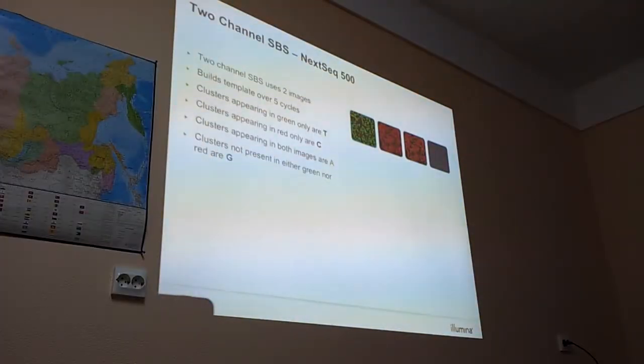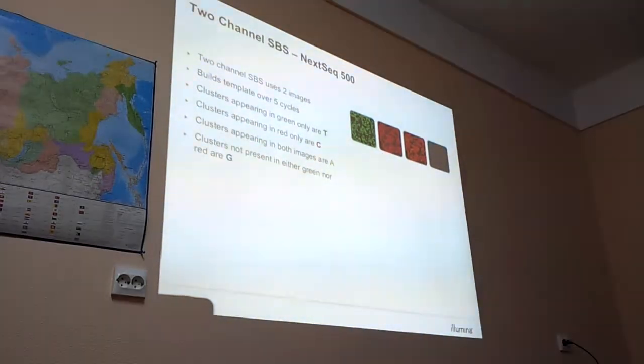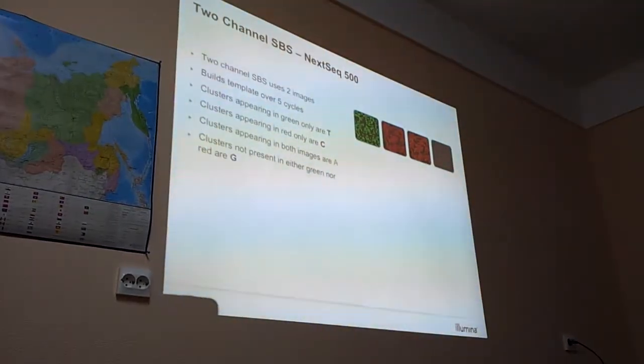It's possible, but unlikely. And anyway, it determines the cluster position, and then after these 5 cycles, if there is still a mixed signal, then it will be filtered out. Yeah. Right.